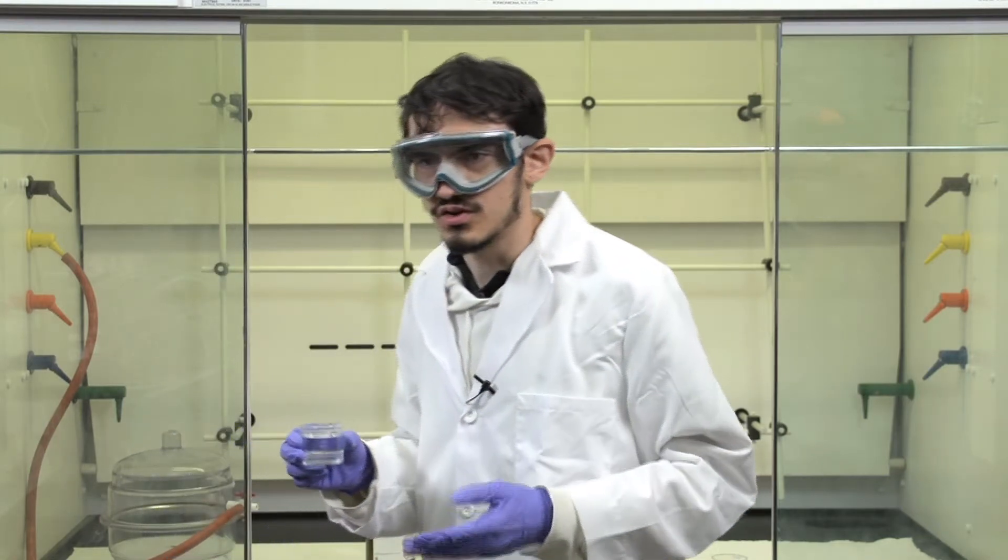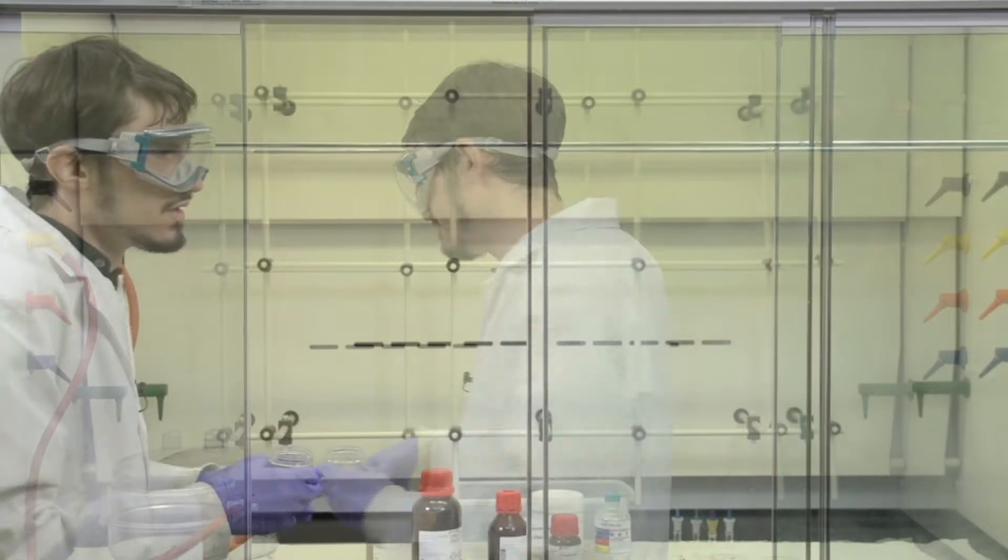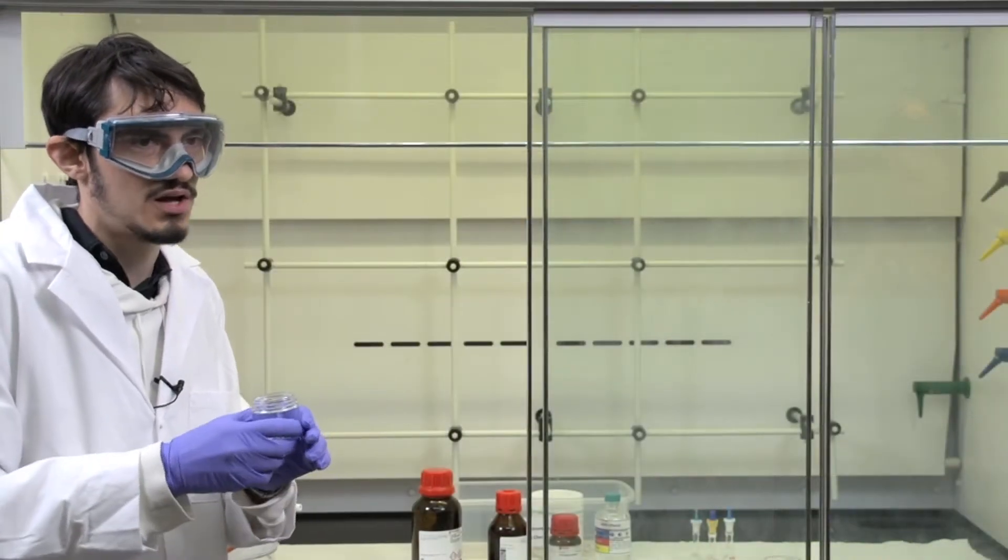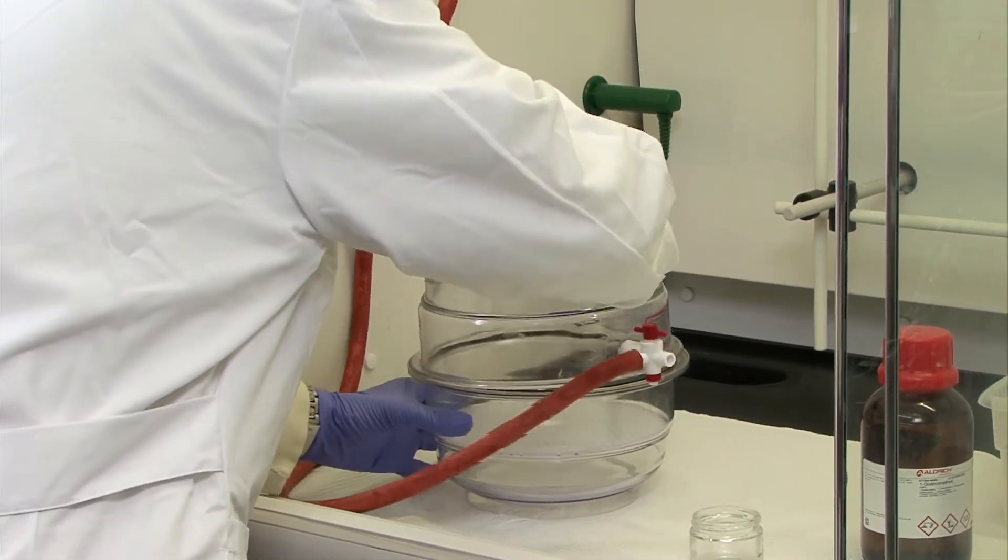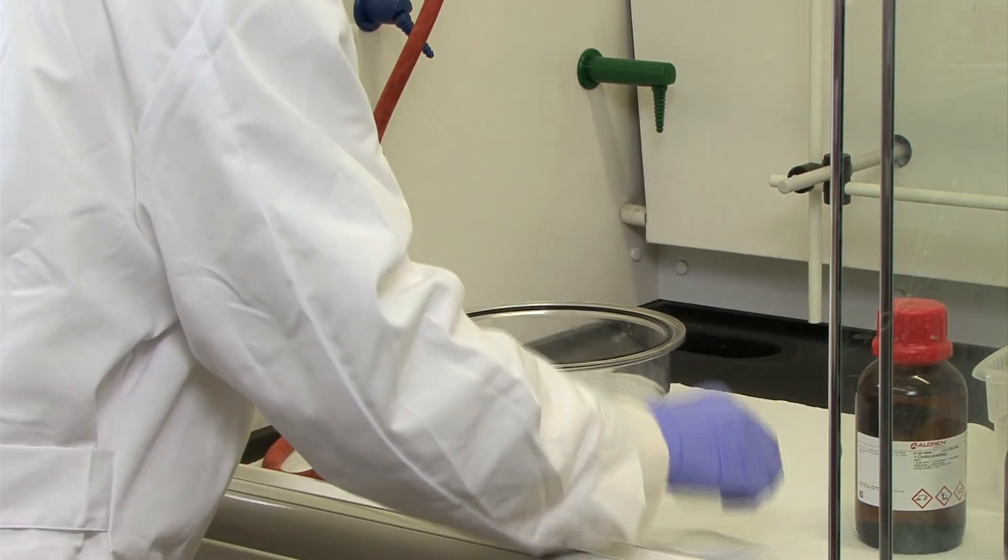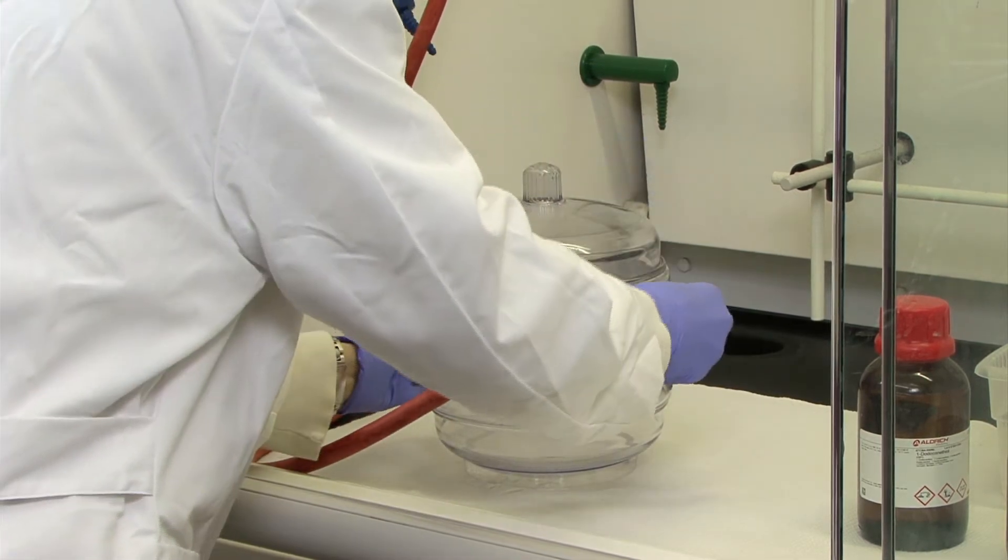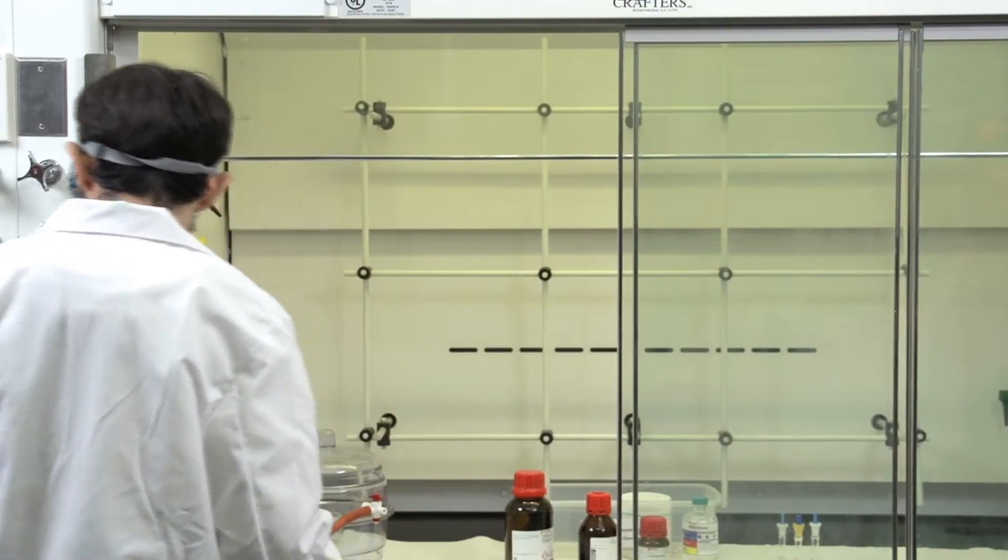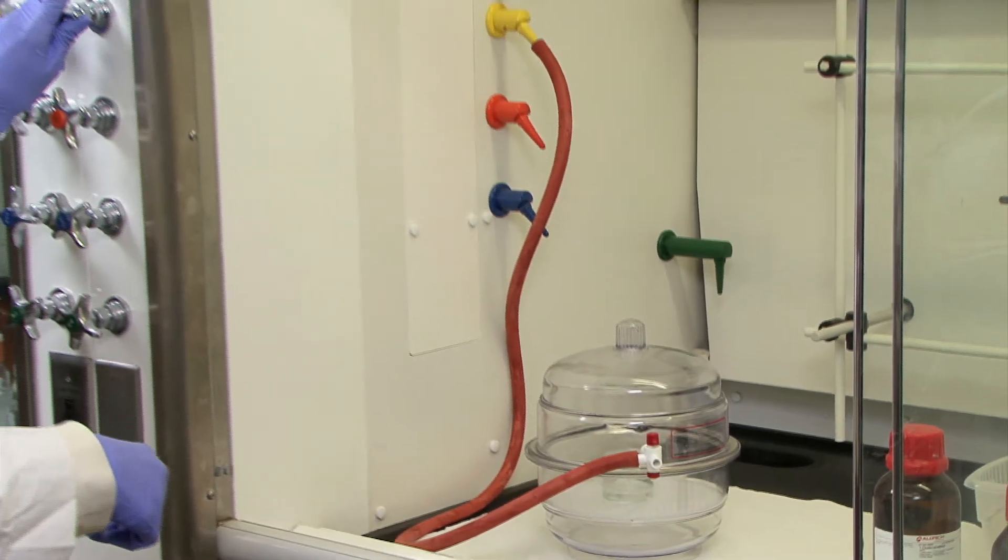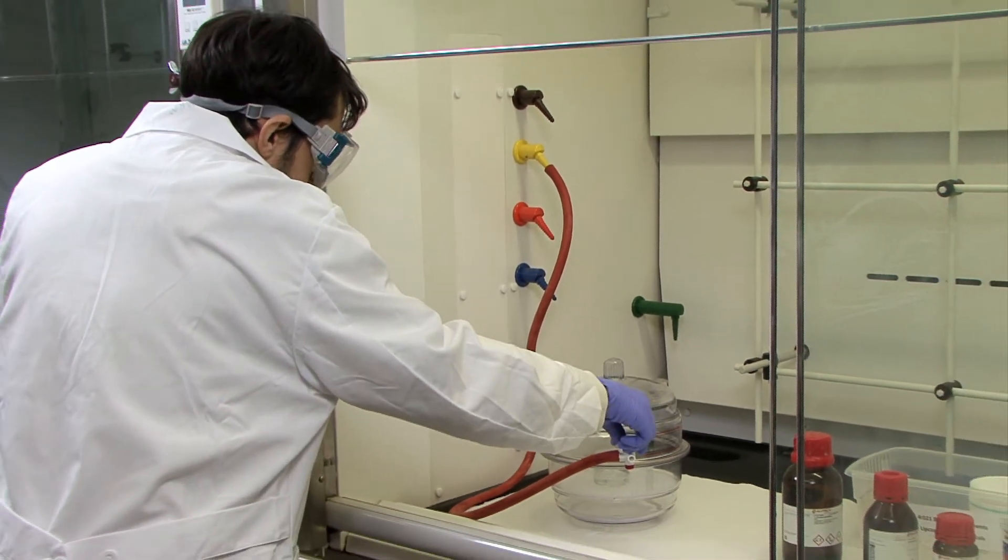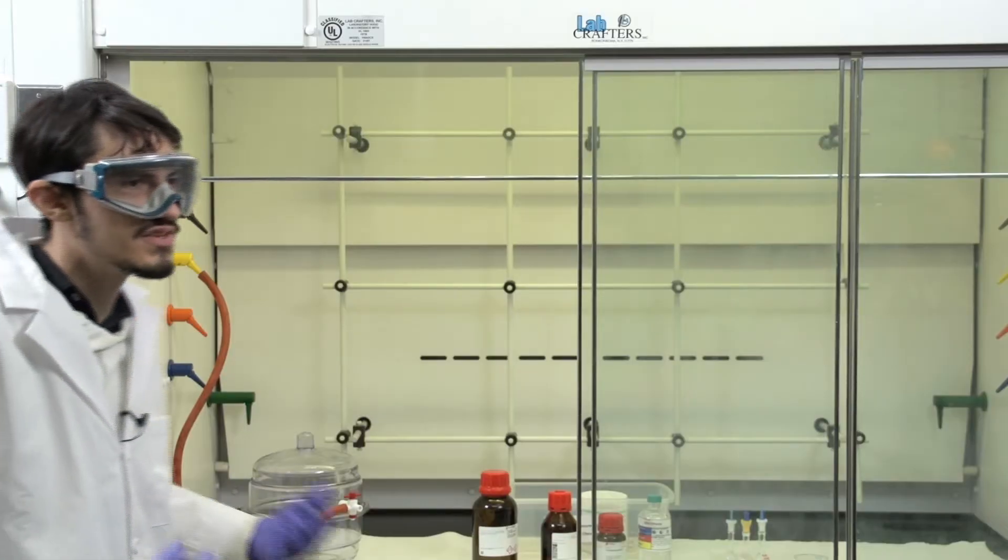Once the mixture is stirred, you want to make sure that it's degassed so that there's no bubbles in it. In order to do this, we use a vacuum desiccator which will be in the hood. So you want to put the jar with the PDMS polymer and curing agent into the desiccator. Make sure the top is on and you want to leave this here for 20 minutes.